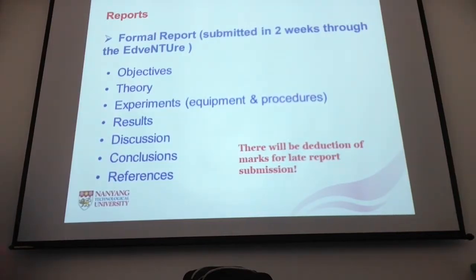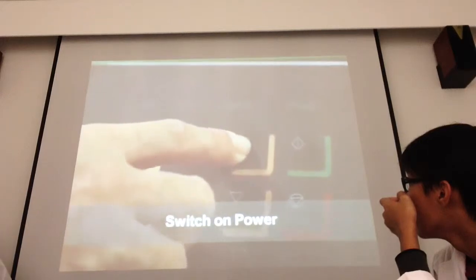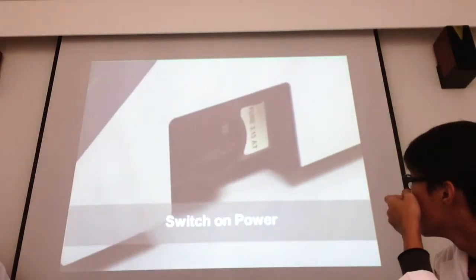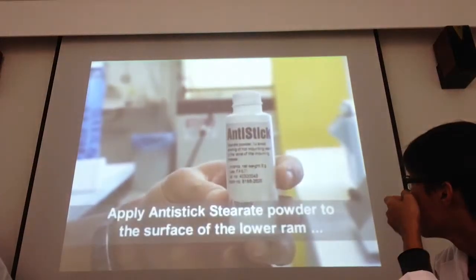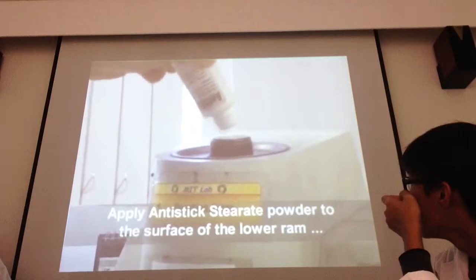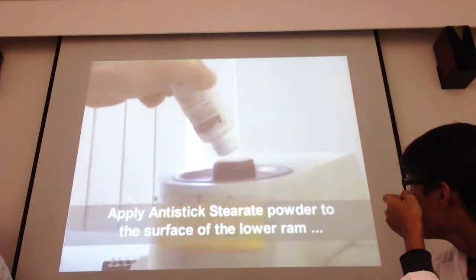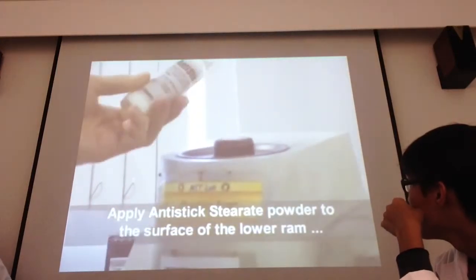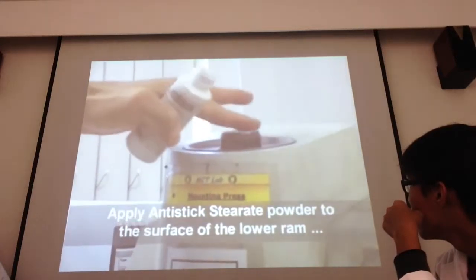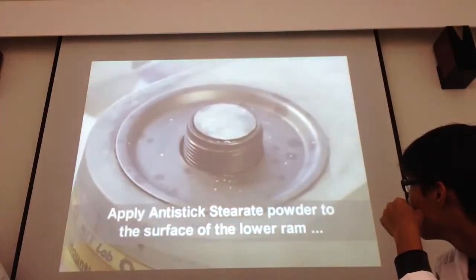Benson, guide me through today's experiment. Before I go on, please look through. Sometime during your third year, you will get hands-on experience with some of the further elaborate processes. So this one is the anti-stick powder, so it won't stick to the ram when you finish your mount.